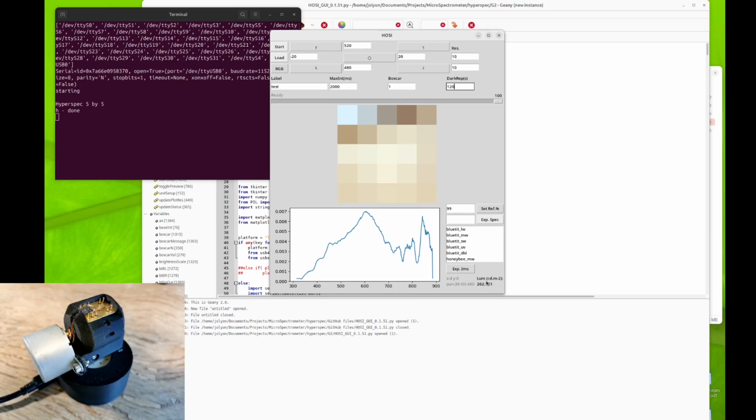Every pixel I click on, I can see the candelas per meter squared, so the luminance of that. So it's a human metric, obviously, and the location of that, the XY coordinates. And this is useful information if you're sort of framing a shot in low resolution first, and then take a high resolution scan of it once you know exactly what's where. That's quite useful.